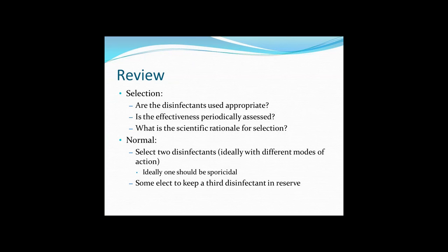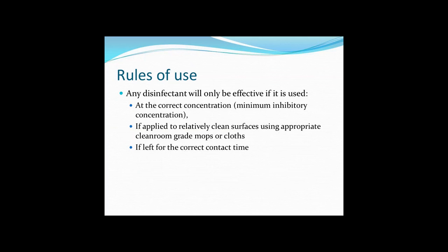Importantly, any disinfectant used will only be effective if it's used at the correct concentration. So here we need to know the lowest concentration below which disinfectants are no longer effective at killing. It's important that we apply the disinfectant to relatively clean surfaces using appropriate cleanroom grade cloths or mops, and also that we leave it for the correct contact time.